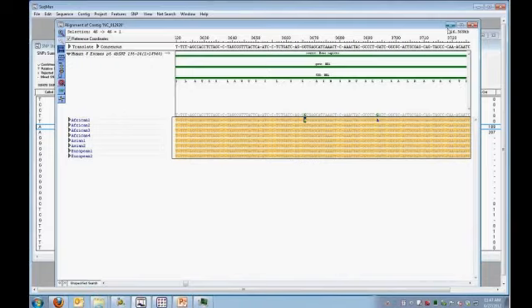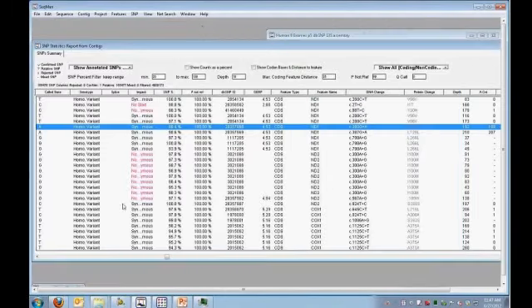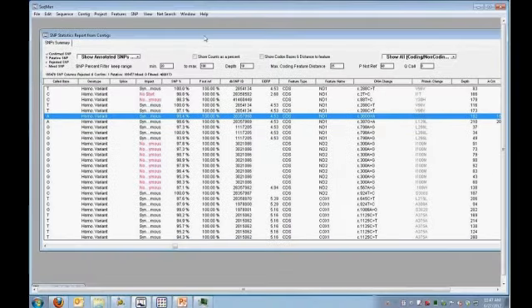So now, on this type of analysis, you can see that we can look at each sample and we can see where the SNPs are. And the SNP report does allow us to do some comparisons. But if I want to do additional levels of analysis, for instance, a question for this type of experiment might be, do the African, Asian, and European individuals have SNPs in common or SNPs that are unique to that set?